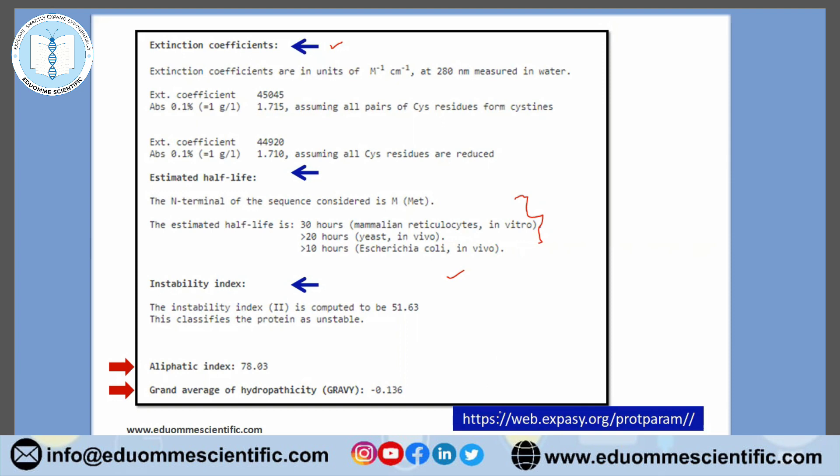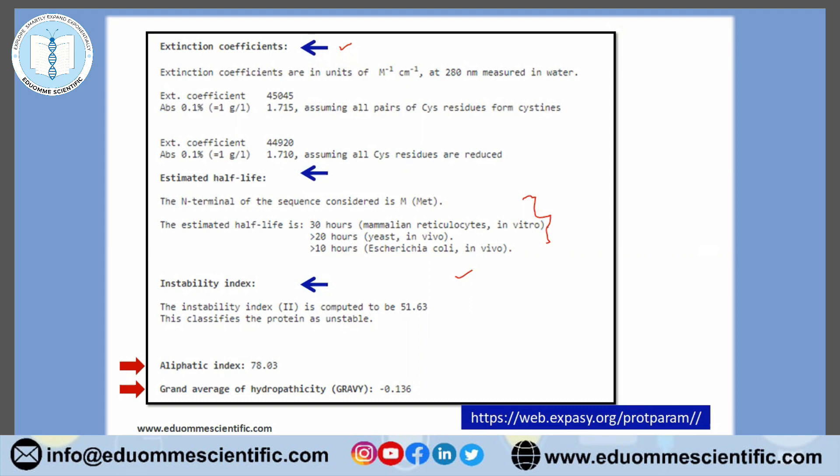So mainly the metabolic fate of a protein depends on its N-terminal. By using the N-end rules, they calculate and estimate the half-life and provide us a time interval showing how stable this protein will be in physiological conditions and in the wet lab or at room temperature. Along with this, the instability index provides an estimate of the stability in vitro, or during test tube conditions. A protein whose instability index is less than 40 is predicted as stable, while above 40 it will be unstable. The aliphatic index of a protein is also very important. It is defined as the relative volume occupied by the aliphatic side chains — that is alanine, valine, leucine, etc. — and is regarded as a positive factor increasing the thermostability of the global protein.